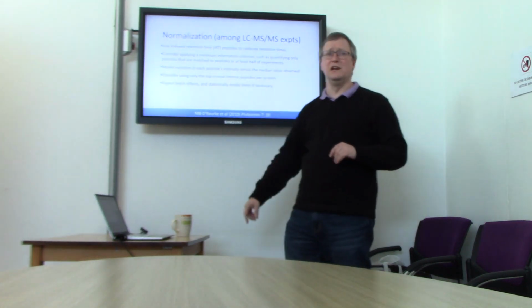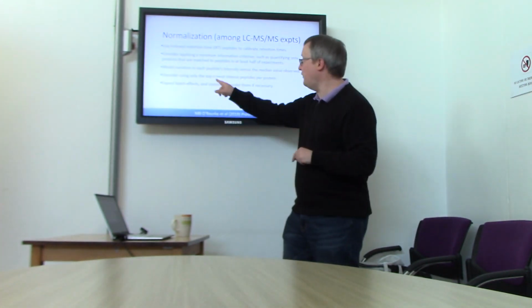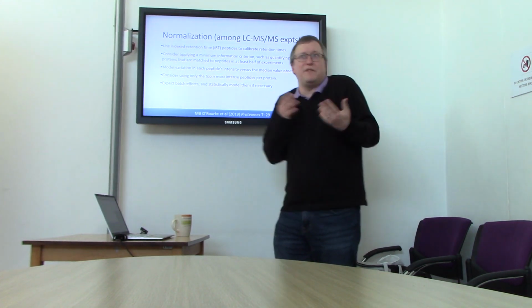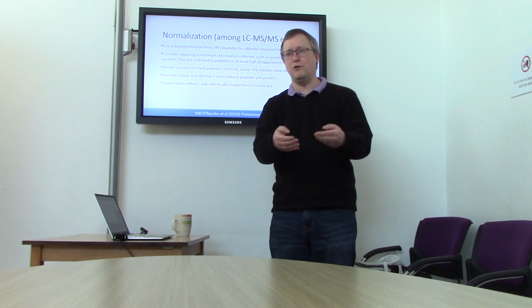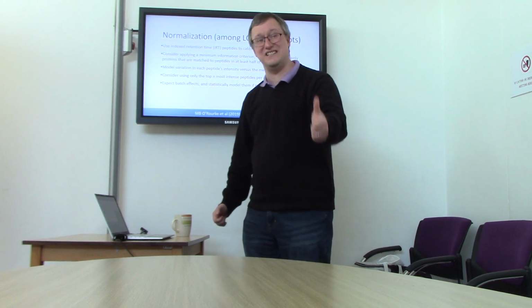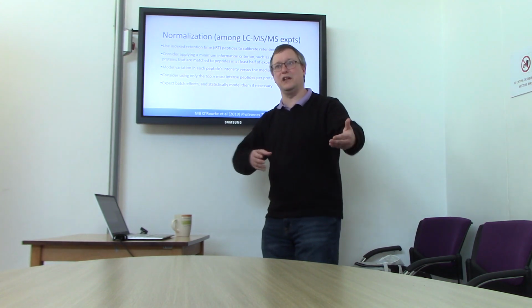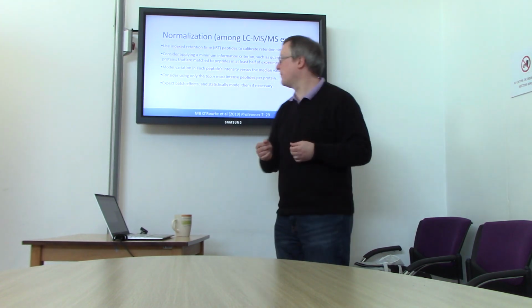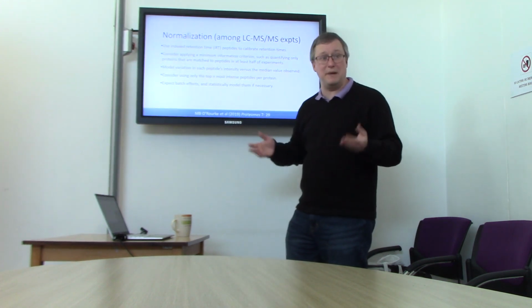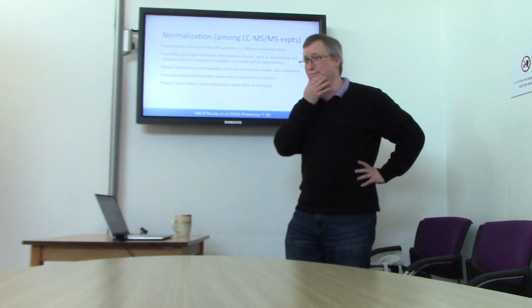It's frequently the case that people who are trying to roll up peptide ratios into protein ratios will focus on only the top few peptides by intensity. If you're trying to build a protein ratio off of a peptide that's got a vanishingly small signal, it's got a correspondingly high CV value, and that noise is just going to distort the larger protein ratio by all odds. So you should think about focusing on, say, the top 3 or the top 5 peptides by intensity, because the most intense signals should have the least noise to them.